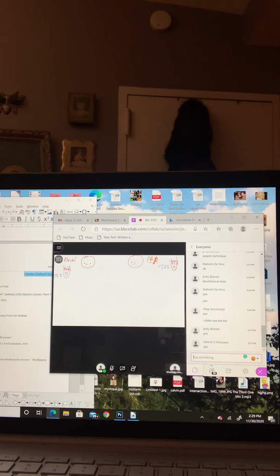Okay, for the MacConkey, we did not talk about the MacConkey. It is selective and differential. You can tell if your microorganism is like what? It's used to differentiate which, what. So if your microorganism is like mannitol, or what's... Mannitol or lactose. So it produces acid. So it's to differentiate what?